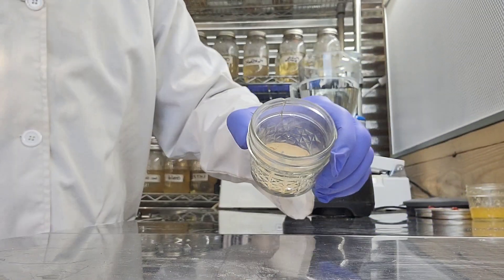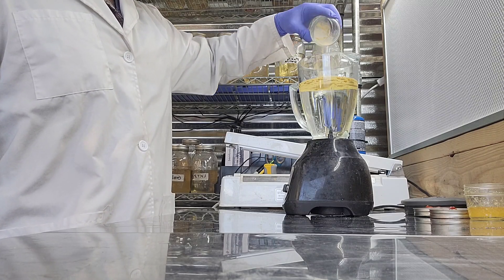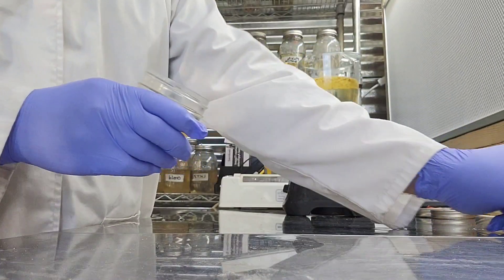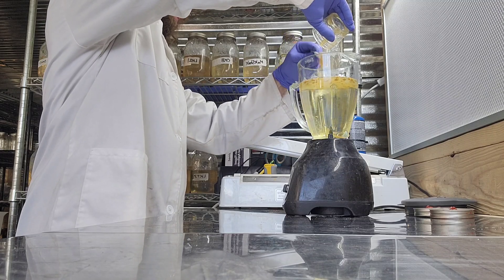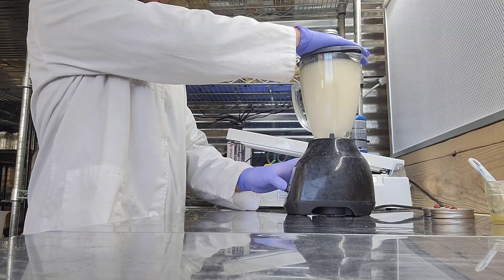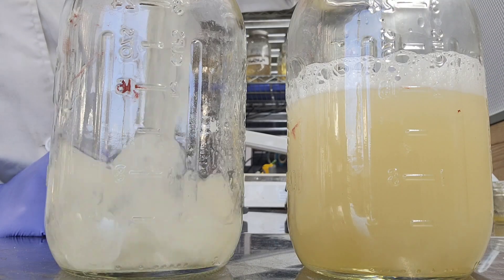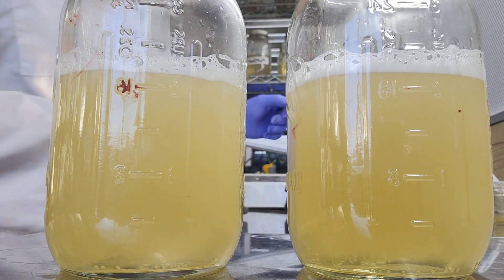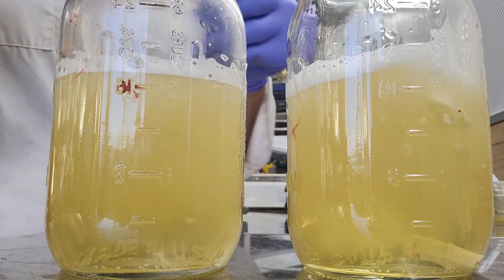Two grams of soya peptone already weighed out — adding it to the blender. Now we add the honey: 40 grams weighed out, scooping it in. We put the lid on and blend that solution up. After blending, we'll distribute it evenly between two one-quart mason jars. Don't forget to add a magnetic stir bar inside each jar — that will spin the solution to mix up the mycelium after sterilization.